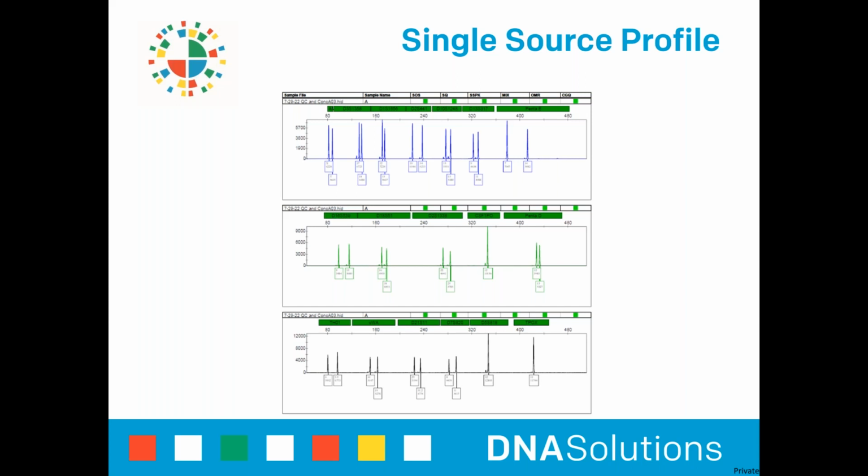As we move into other examples, you'll get a visual of what we see when we obtain a mixture, as well as when a partial profile is obtained from a sample.